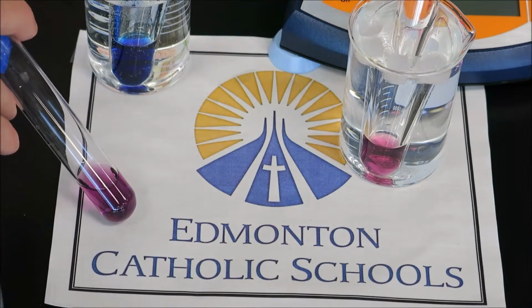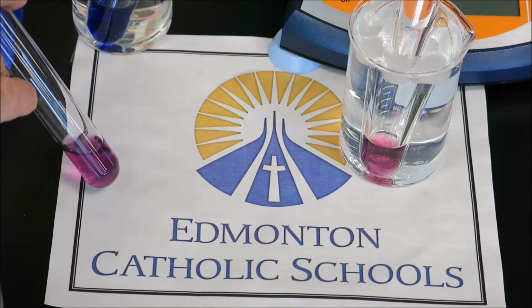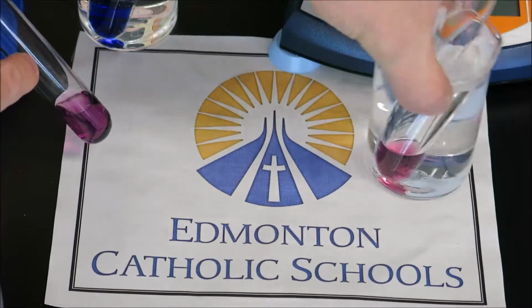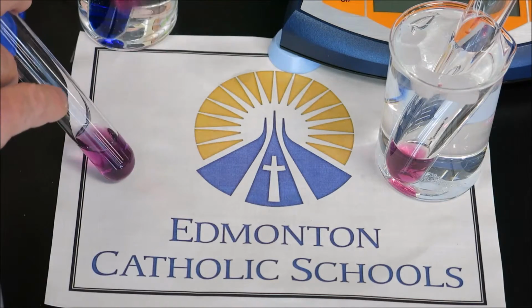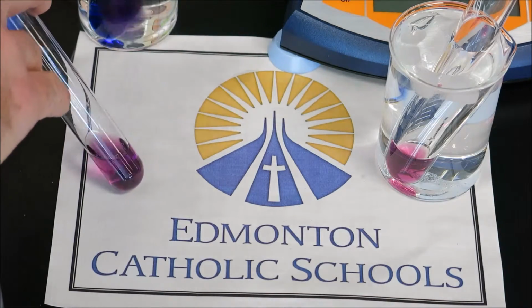And one more time, we will take a look at the changes. We can see increasing temperature or adding energy has shifted blue. We can see decreasing temperature or removing energy has shifted pink. We can see the addition of water shifted pink, and we can see the addition of salt as chloride ions has shifted blue.